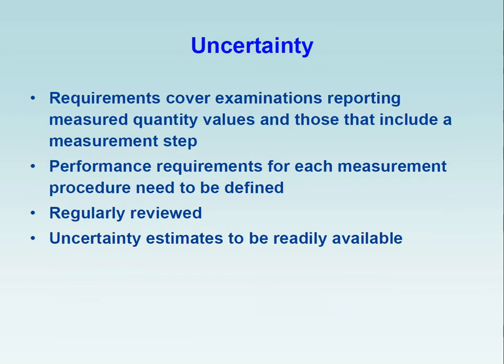Uncertainty. Requirements cover examinations reporting measured quantity values and those that include a measurement step. So if you're performing a complex panel, you may not be issuing a measured quantity value. You're issuing an interpretive report. And maybe that doesn't, so therefore it doesn't require you to conform. But certainly if you're enumerating anything, CD34, FMH, where you're issuing a result, you need to be able to state your uncertainty, or your certainty, that that result is a true value.